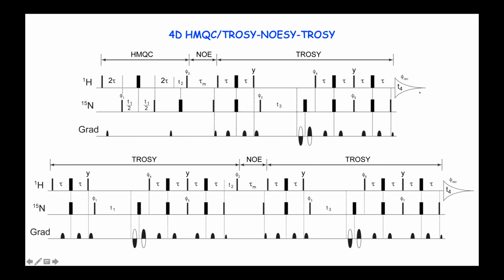And so in the end, you get a better solvent suppression. The other thing is that by phase cycling this pulse, the axial peak caused by T1 relaxation during the mixing time is removed, because even though you're not directly phase cycling the proton, your signal is still going up and down depending on this phase, okay?